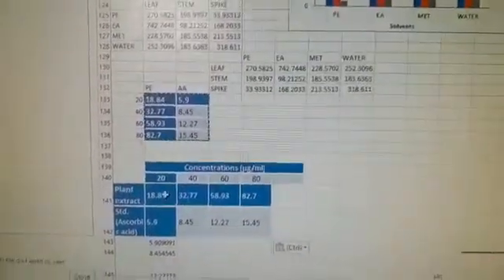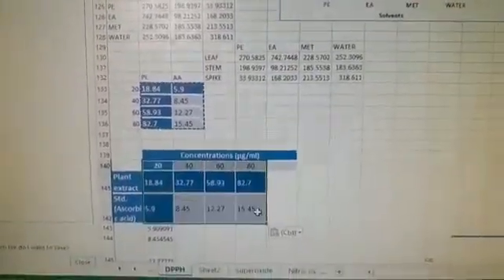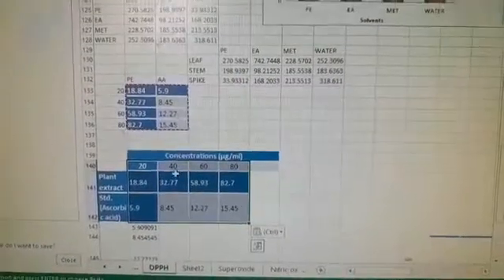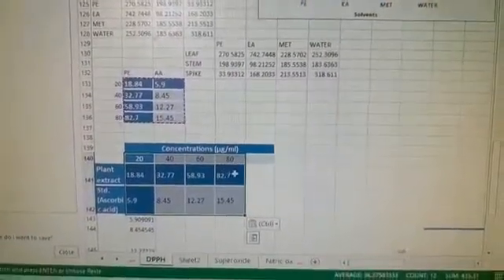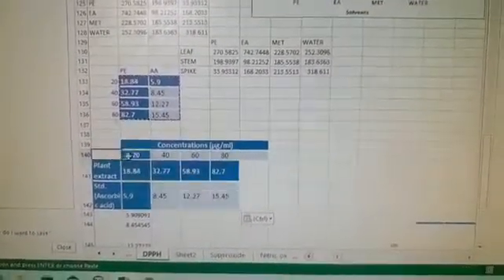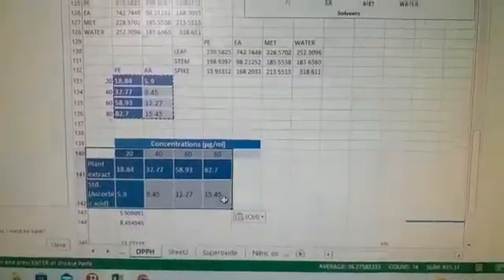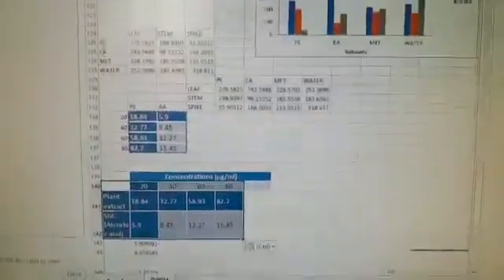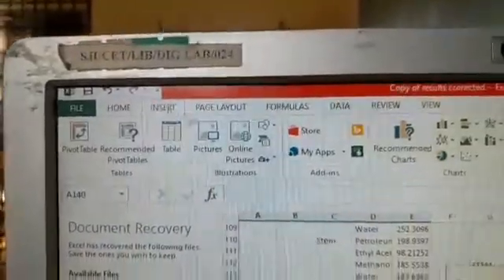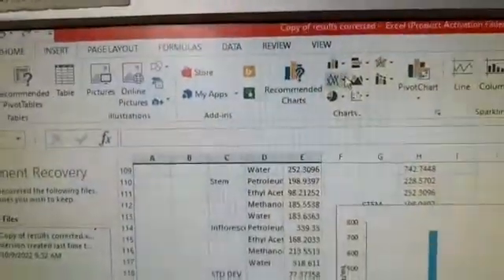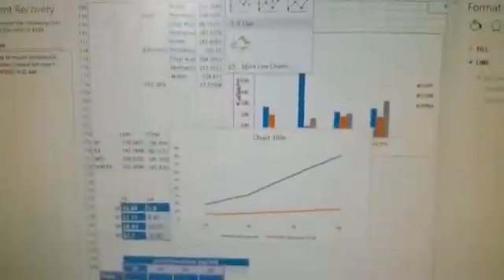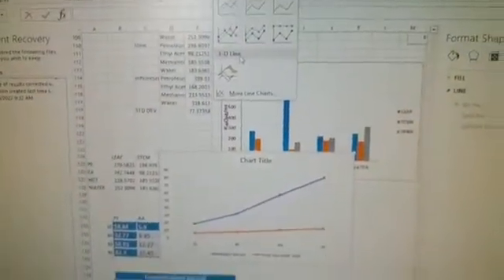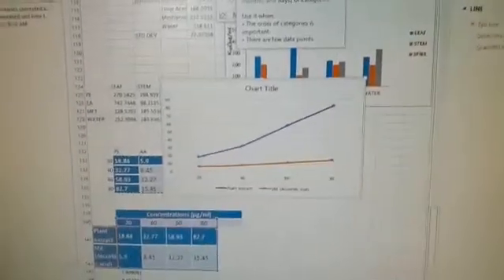Select all these: 20, 40, 60, 80 percentage of inhibition and the plant extract values. Once you select, go to Insert, then select the graph.